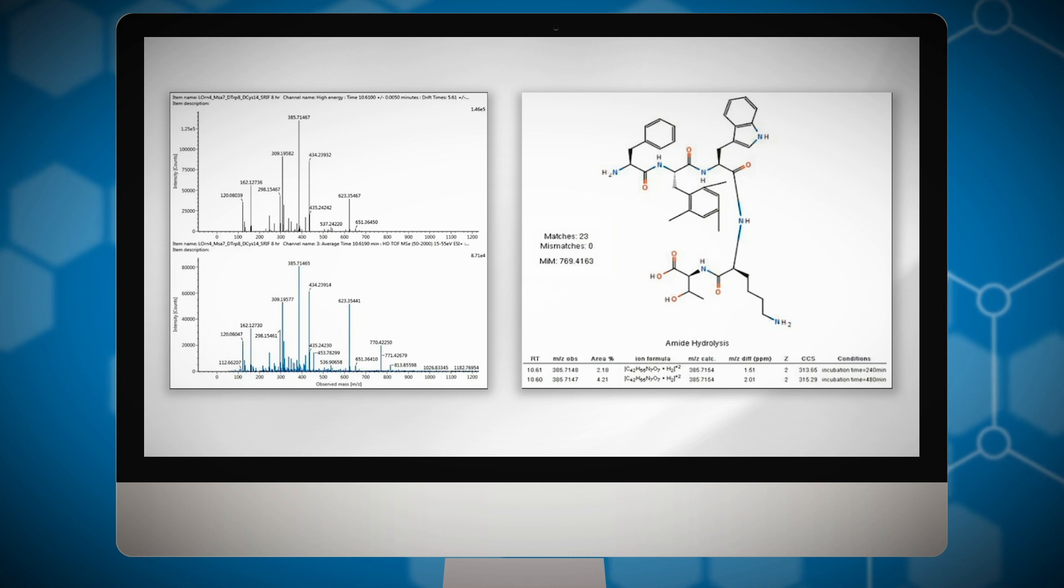This is important because Mass MetaSite uses a scoring algorithm which determines how many product ions can be successfully rationalized from the structure of the proposed metabolite and which cannot. On the right hand side we can see that all 23 observed product ions can be explained and none have no plausible assignment, leading to high confidence this is the correct interpretation of the data. This is a clear benefit for the discovery MetID workflow.